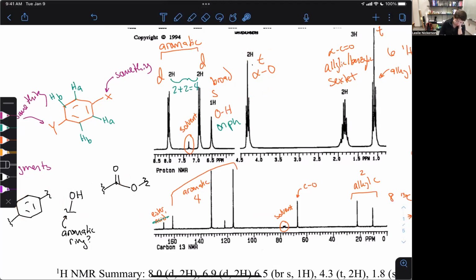When we're trying to come up with the fragments apart from that, as soon as you see a 2H, I don't want you to be seeing a zebra when it's a horse. If it's a 2H, it's probably just a CH2. So we're going to consider it a CH2 here. And if I'm trying to figure out how many neighbors are going to be over here, if I have a triplet, that means that 3 minus 1 is going to be my number of neighbors.